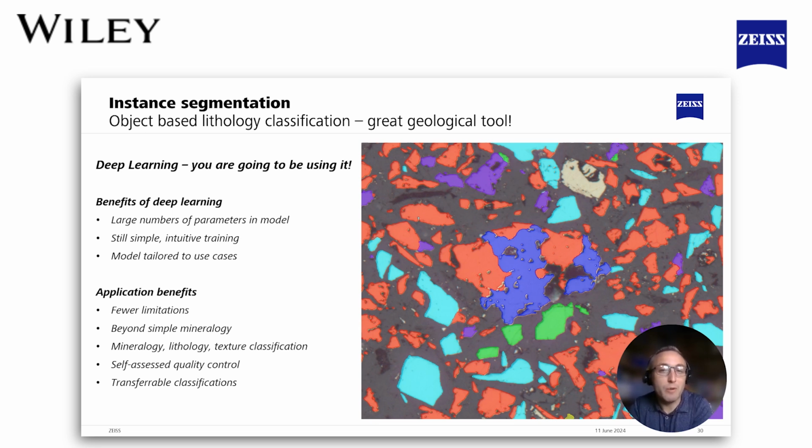That means we have genuine big data that can start to be tackled as large databases and look at what's happening in tens, hundreds, thousands, hundreds of thousands of thin sections or samples, whatever it is that you're looking at, and apply these techniques.